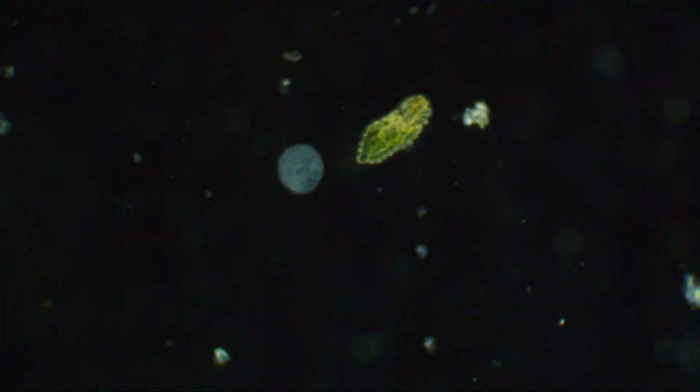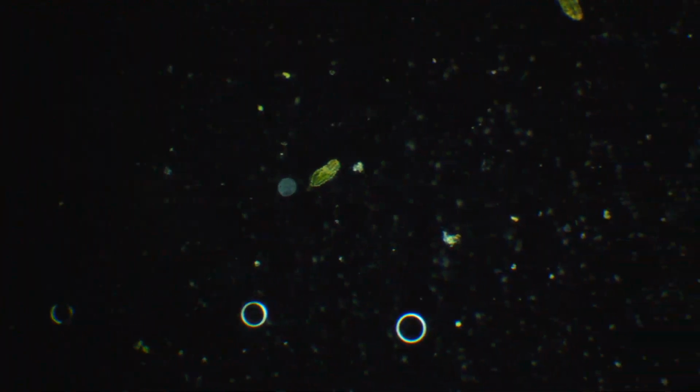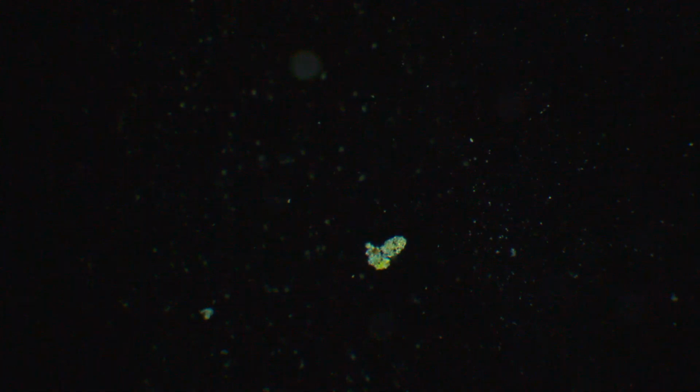Yeah, so pretty soon we're going to be doing oil. We might be doing some blood. We might be doing some muscle cells, some meat basically, where we look at raw meat and cooked meat and might use some fancy dyes to make the cell components look more visible, basically.